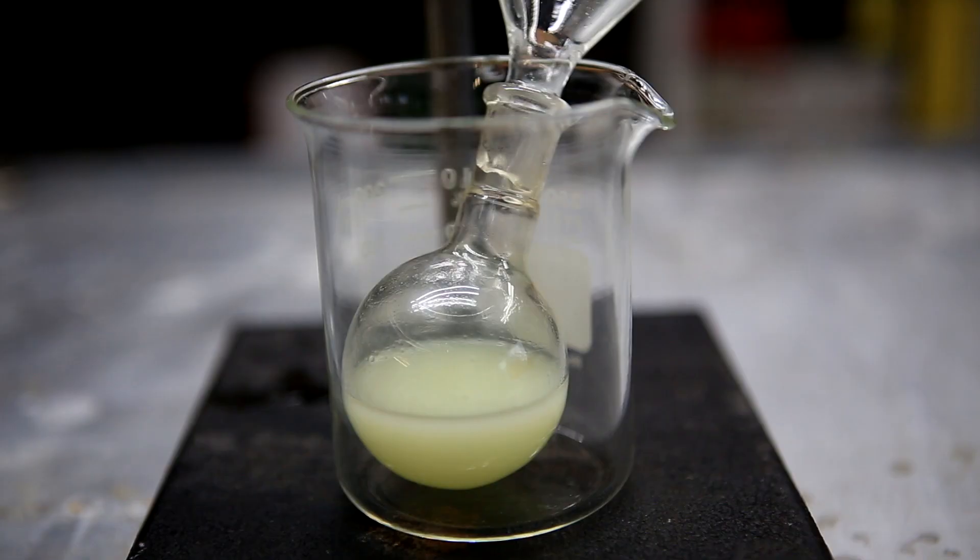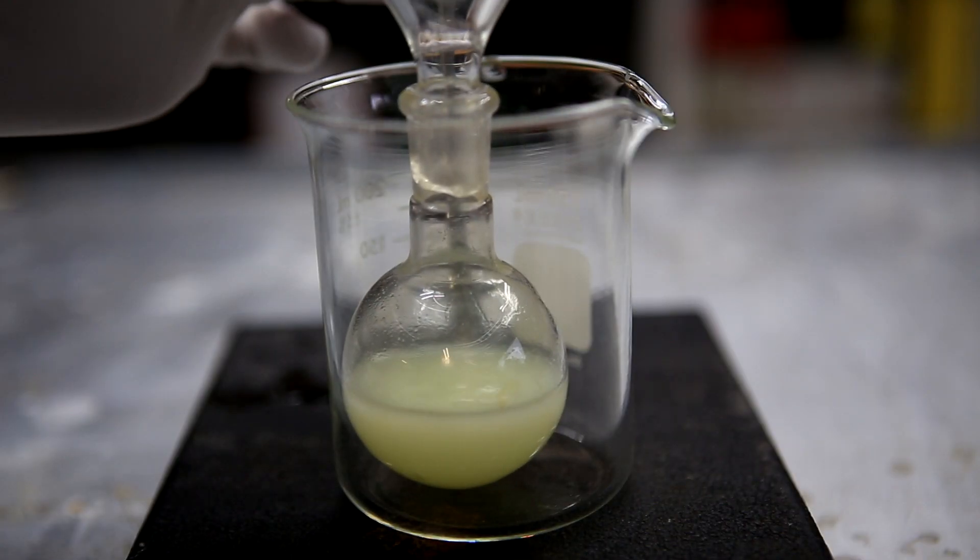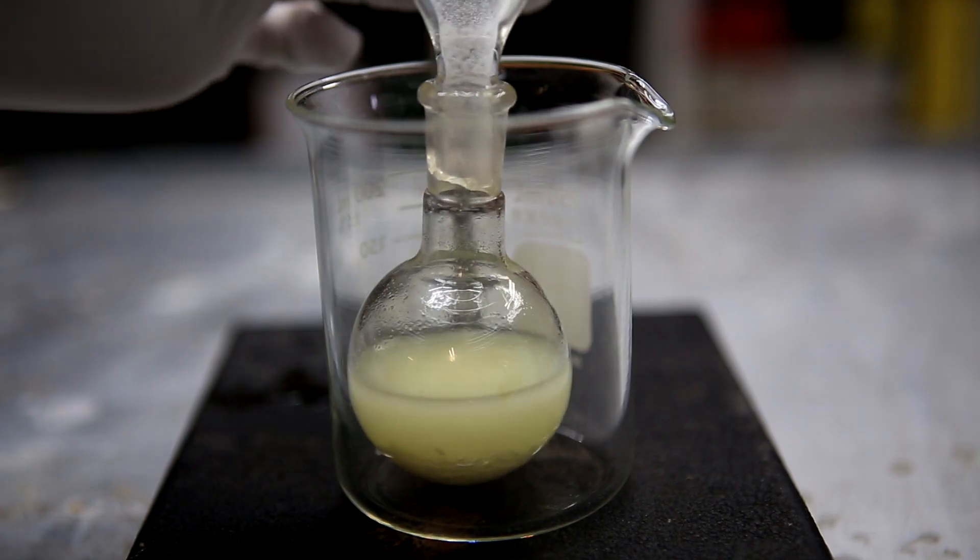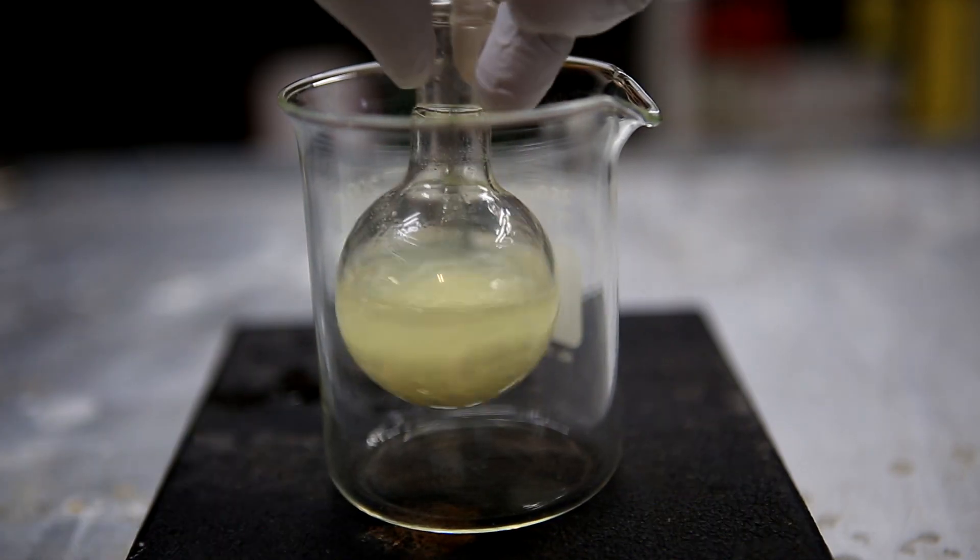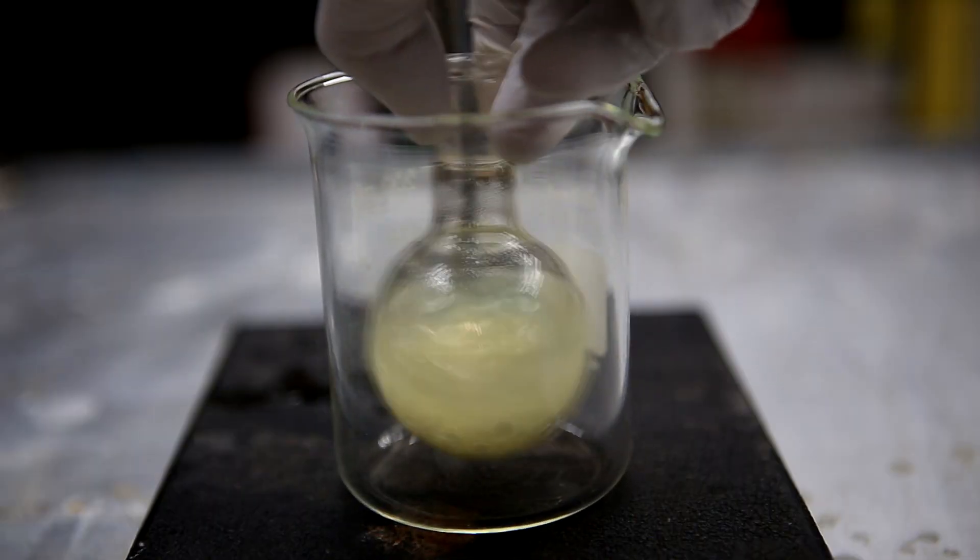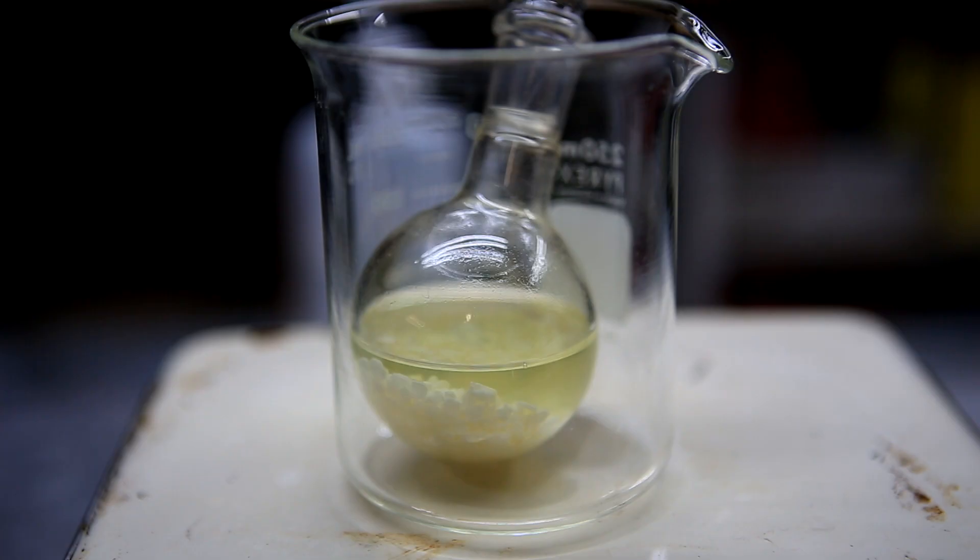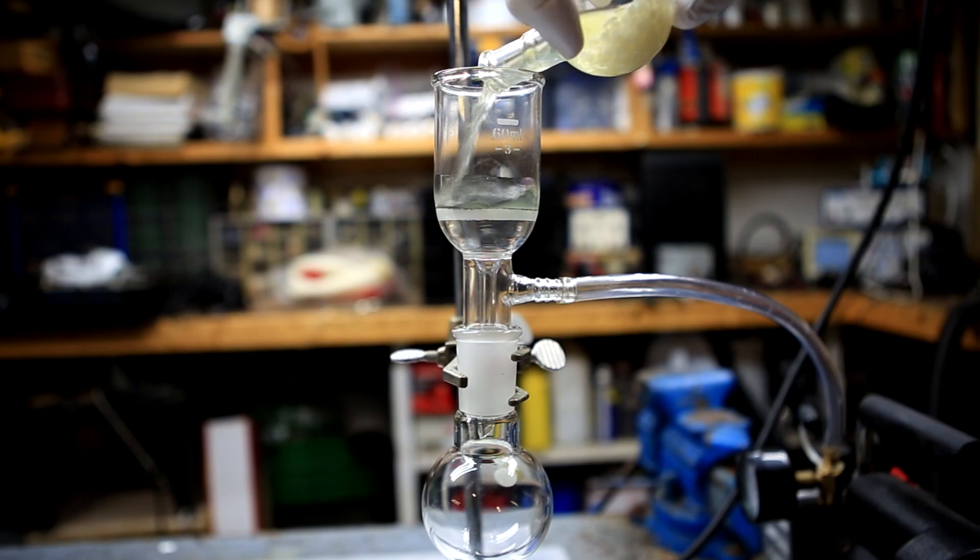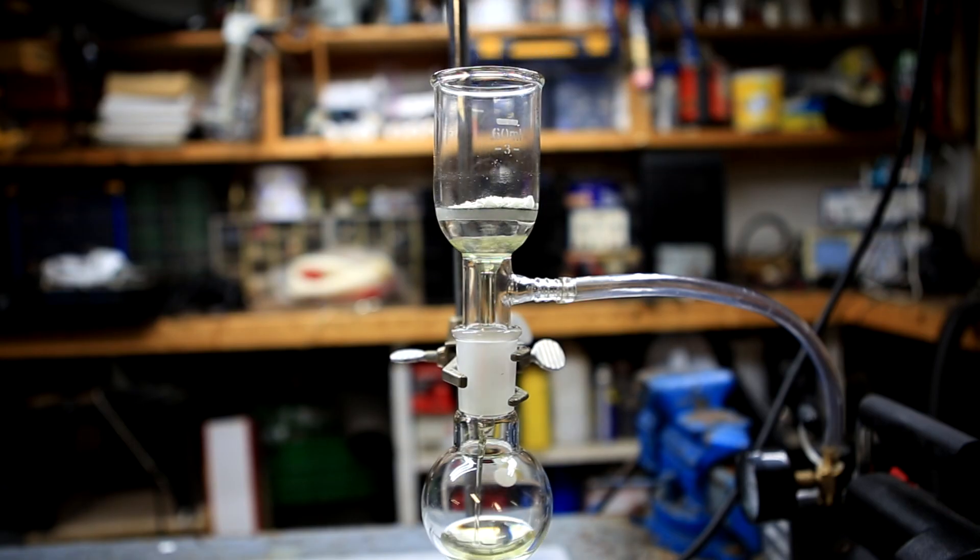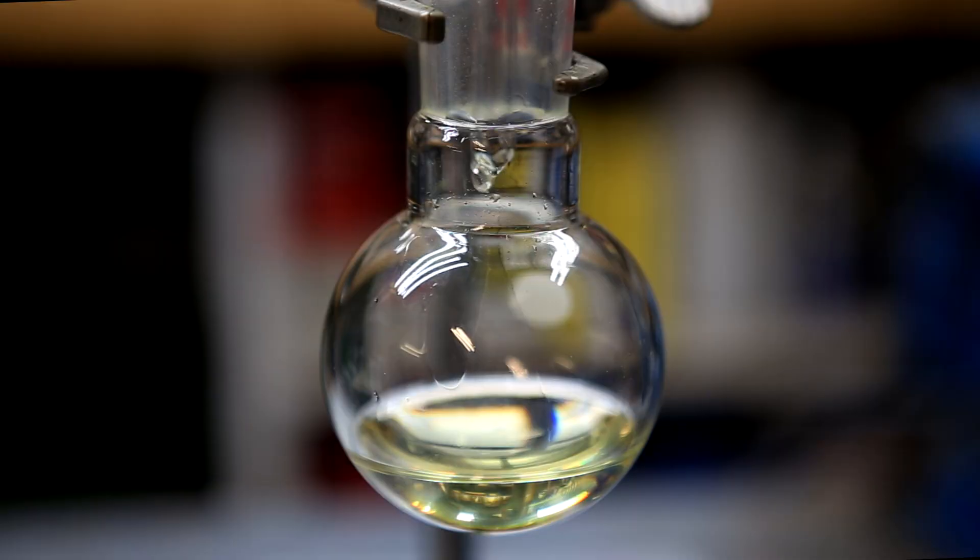To get rid of any remaining water in the nitrobenzene we do this by adding calcium chloride. The calcium chloride is added, the round bottom is stirred, and it's allowed to stand until the solution becomes completely clear. The calcium chloride is then filtered off from the nitrobenzene and we're left with a nice crystal clear yellow liquid.